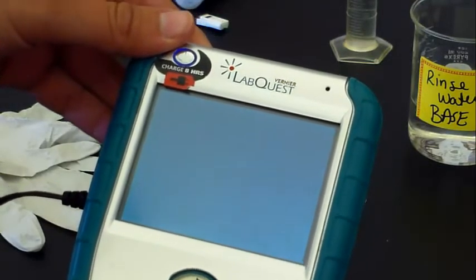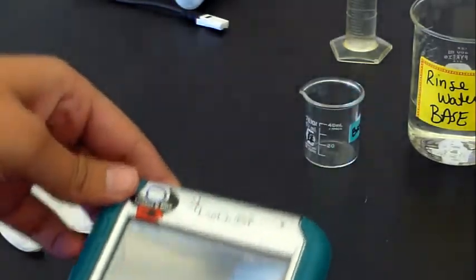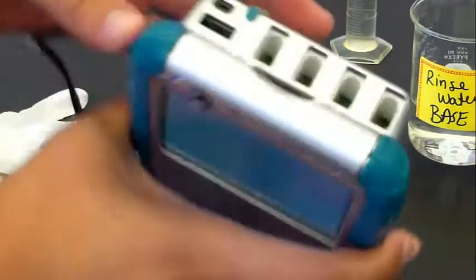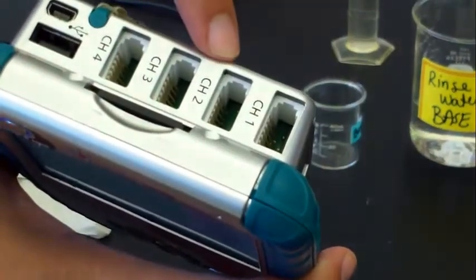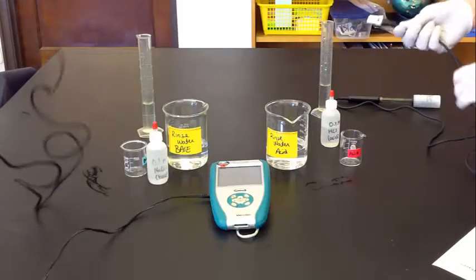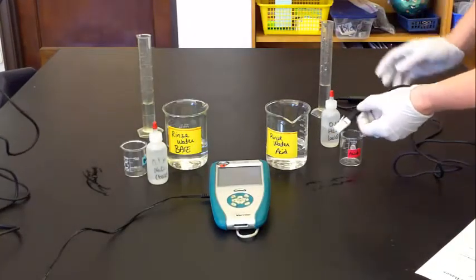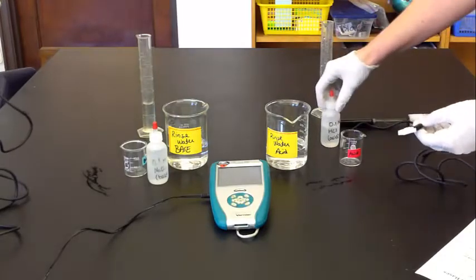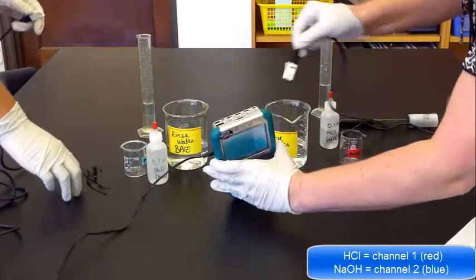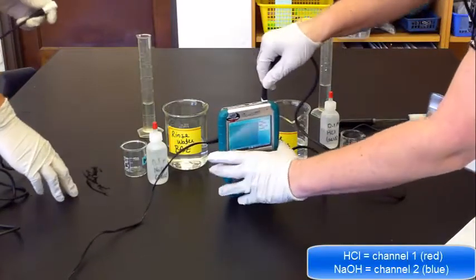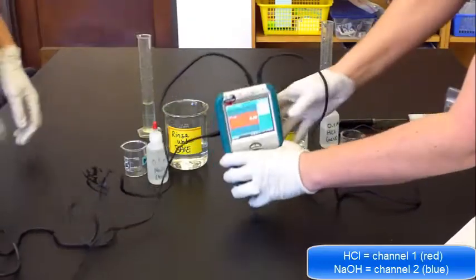For the probes, in the top there are channels, and we will be using channel 1 and 2. So step 1: once the LabQuest is on, you need to plug in the channels. I find that you have the hydrochloric acid in channel 1 and for the base channel 2.